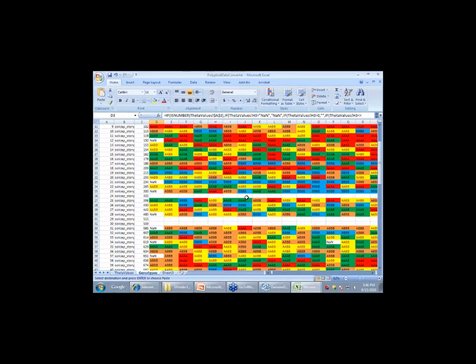But when it comes to mapping data, if this was actually mapping data, then you can start defining haplotypes in the context of mapping, because haplotypes are bins in a sense, genetic bins, which is what Chris might talk about as well. If you don't have polymorphism between markers, even though they're unique SNPs in the genome, your mapping population may not have recombination between those two SNPs, and they become basically bins, which is equivalent to a haplotype, where all genotypes within that bin have the same haplotype. We're not at haplotypes there yet, but that's really the goal.